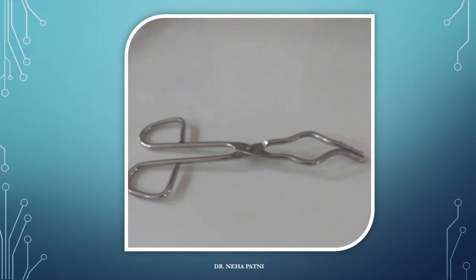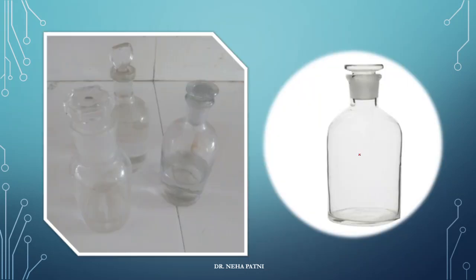When you have to hold a porcelain piece, you obviously need to use these tongs in order to hold it. These are basically reagent bottles in which you can keep any kind of reagent. You can see they come in different shapes and knobs, but the basic aim is to store reagents.